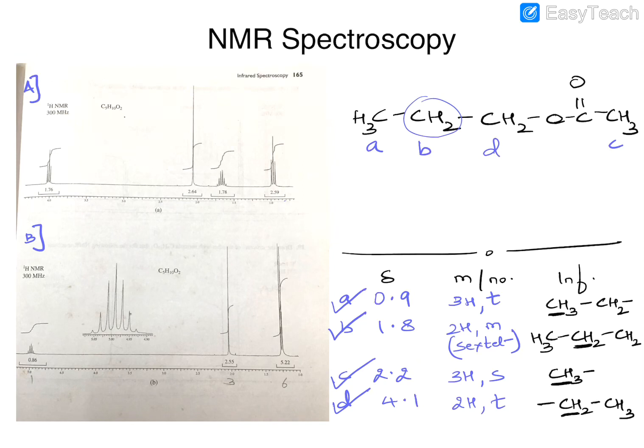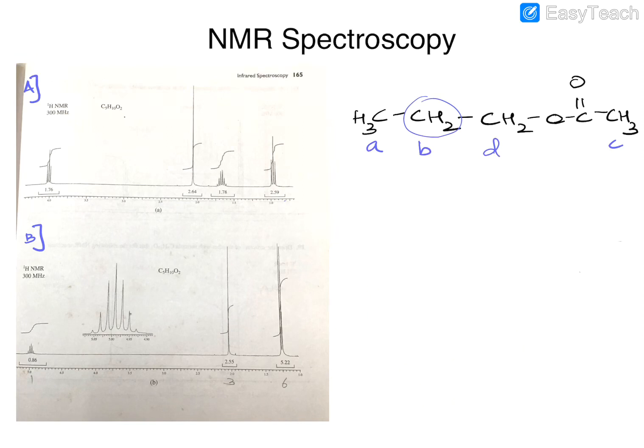So that's how we could do structure elucidation from the NMR spectrum. And I'll leave you to decipher the structure of the molecule that results in spectrum B for yourself. The steps are simple. Peak integration first. After identifying the number of protons that result in the 3 peaks that are seen in the spectrum of molecule B, you can then infer the nearest neighbors from the coupling patterns, and based on the nearest neighbors and the delta values, you can predict the structure of the molecule.